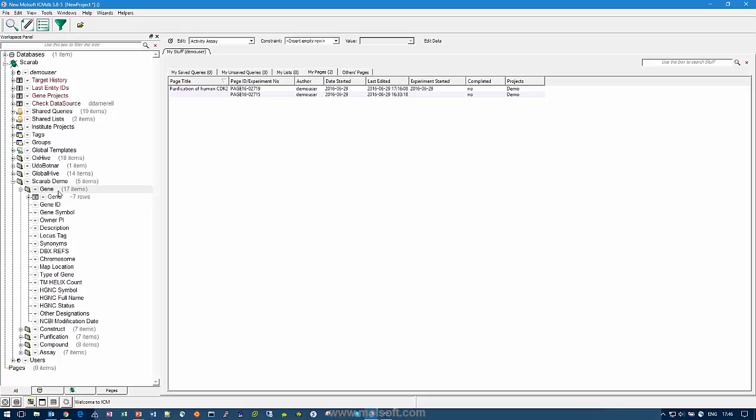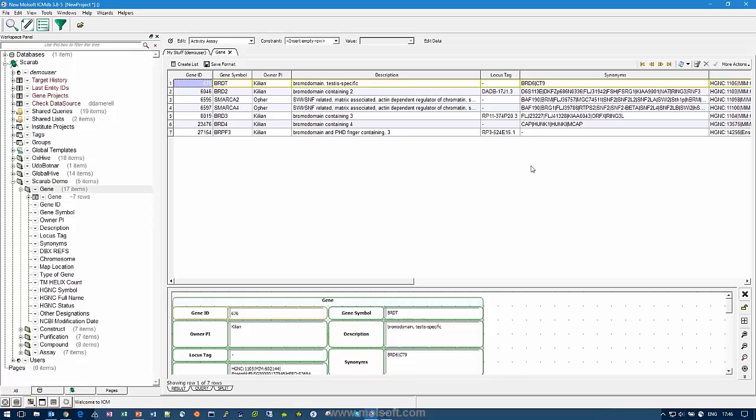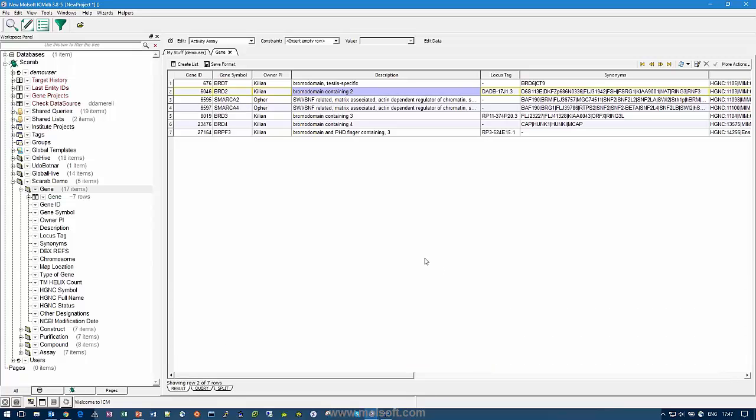So let's say I want to edit the data. I can browse the data, edit the data, insert an empty row. Let's just do edit data for now. So here's all my data. You can see we also have a card format down here. If I click, it changes to the card format. You can actually modify how this card format is shown, and that can be saved along with the query, but I'm not going to go into that today, so I'm going to switch that off.